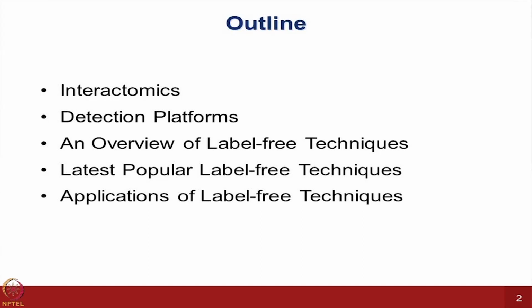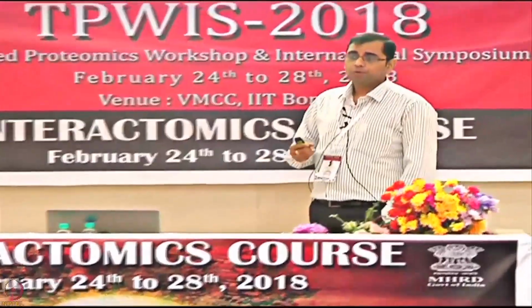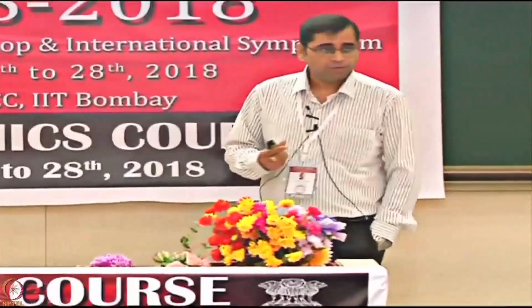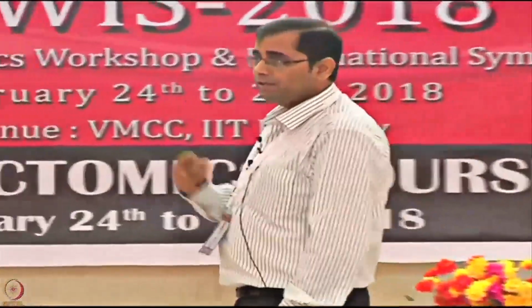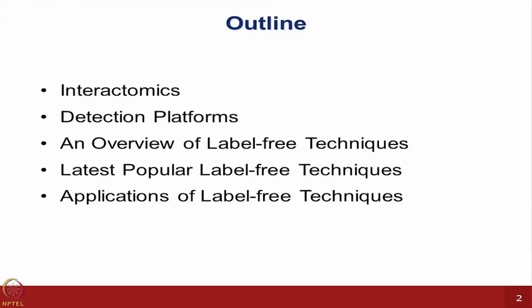Then some overview of the label-free technologies. There are many, in fact. You just got some exposure to SPR, surface plasmon resonance, but there are many emerging technologies which have started making some impact, though many of them are still in the testing phase. Some of the latest popular label-free technology platforms we will cover as we go along in the course, and then a brief overview of applications.